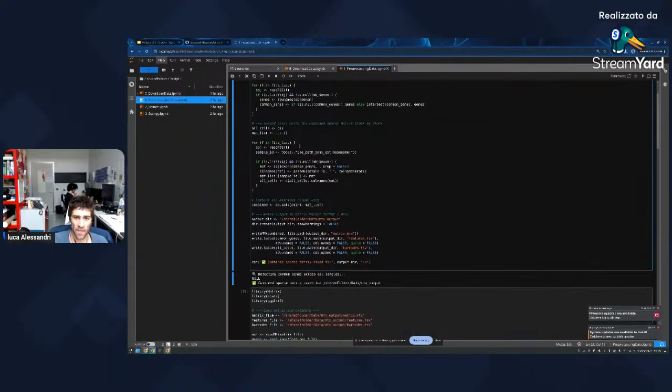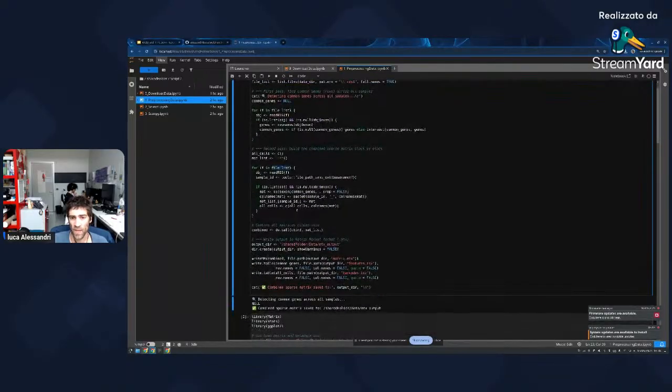The second step instead is to build a sparse matrix block by block. So basically, you read all the files in your list, you load the sample, and then you just load the exon file. You will see that this RDS file has not only the exons, but also the introns and other important things. I would say that for single-cell RNA-seq, just looking at the exons is enough. But always keep in mind your biological question: does my experiment also need introns or other things?